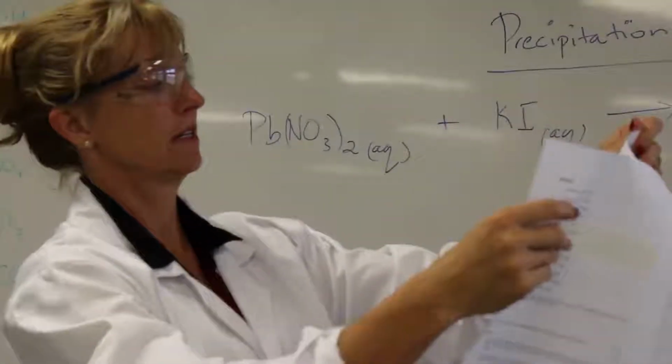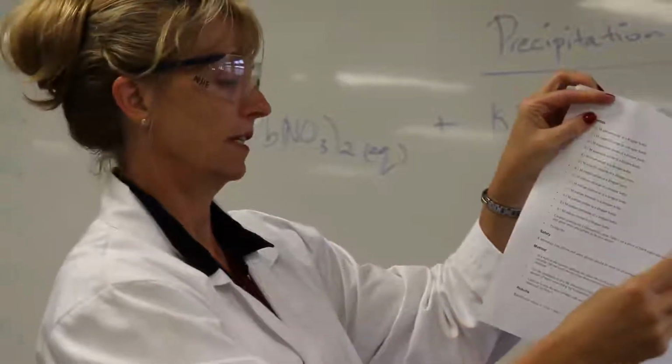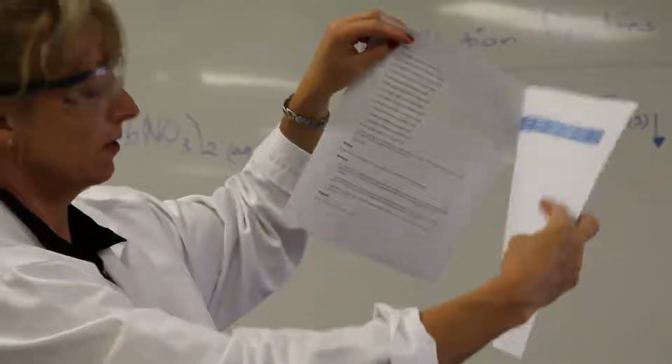Oh, I see, one got left on the other side, which is not ideal, is it? Never mind. So you're going to fill this out.